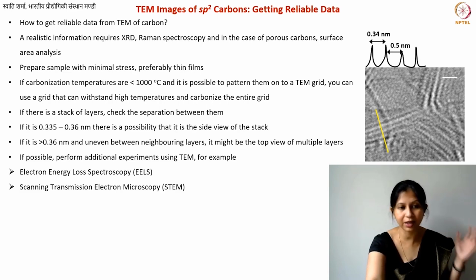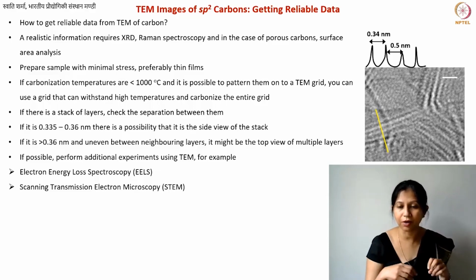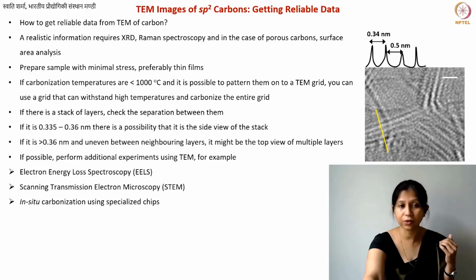Within that there's also something known as STEM, which gives you some idea about the depth of the structures. So if your equipment is equipped with these kinds of things, then you can definitely do that.